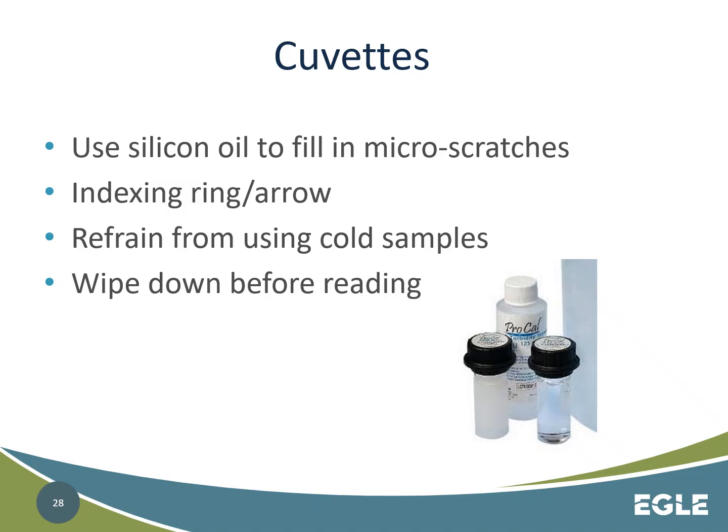That diamond is supposed to be lined up with the arrow inside the turbidimeter. And some of your other manufacturers are the same way. Their cuvettes need to be lined up with their read function. The glass is built so that it is read at a particular range like that, whereas the new Hach ones are read from the bottom using a laser. So there's Lovibond, there's Hach, and there are a few other units out there too that are approved for use.